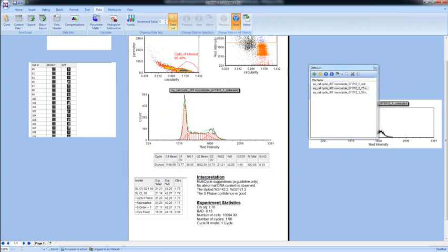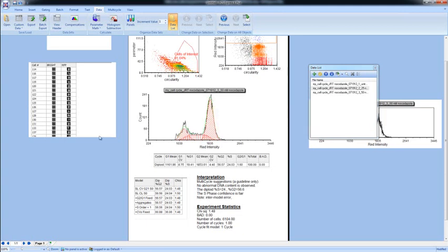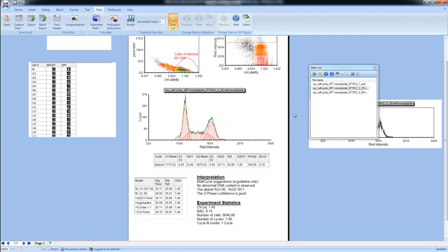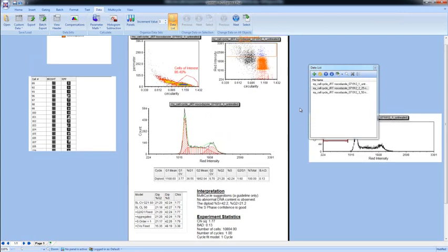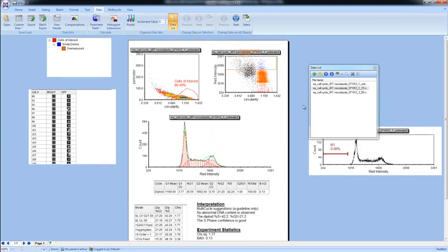and when we hit this next button, what you're going to see is that the data on all of these plots is going to update to the next file in our data list. So you can see that we now went to 25 nanomolar Nocodazole treatment, and that all of our data is automatically being fitted for us at the click of a button. So again, if we click next and we go to our 50 nanomolar Nocodazole treatment, you can see that the G2 phase is really starting to bank up here, and we can really just flip back and forth now to look at all these data samples. So whenever your templates or layouts are set up in FCS Express, it's as simple as loading new data into it, clicking next, and getting some analysis from those data files.